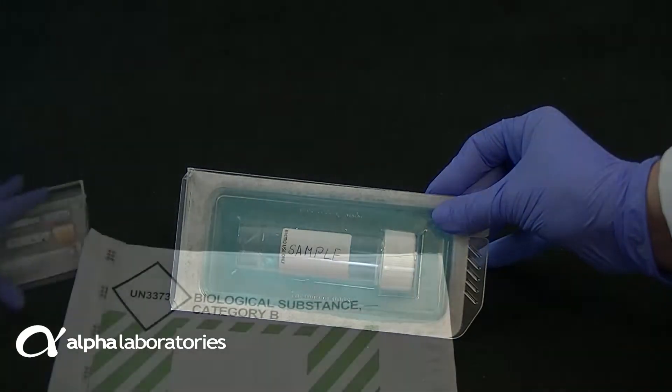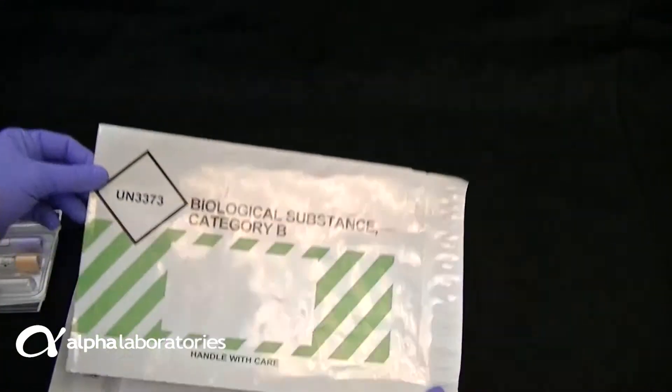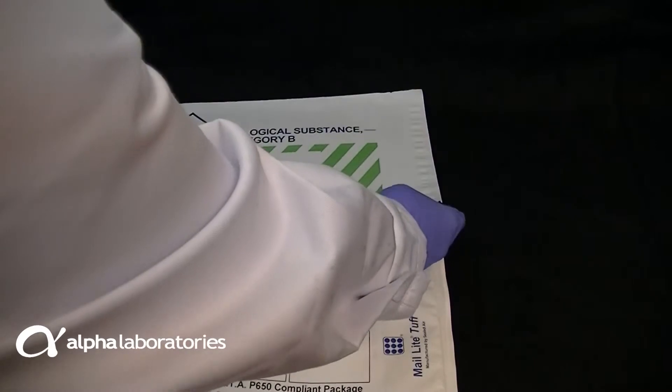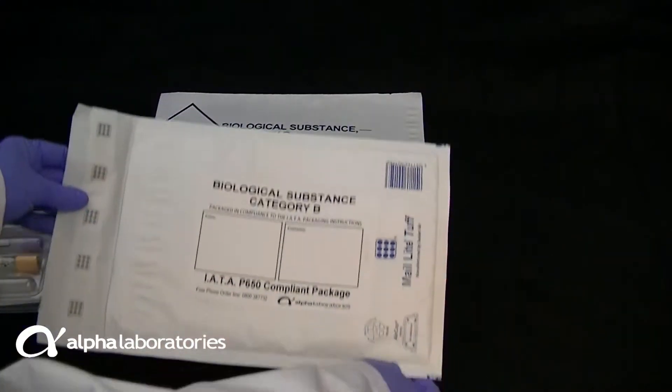This compliant flat pack design also helps to minimise postage costs, making it an economical mailing solution for Category B samples.